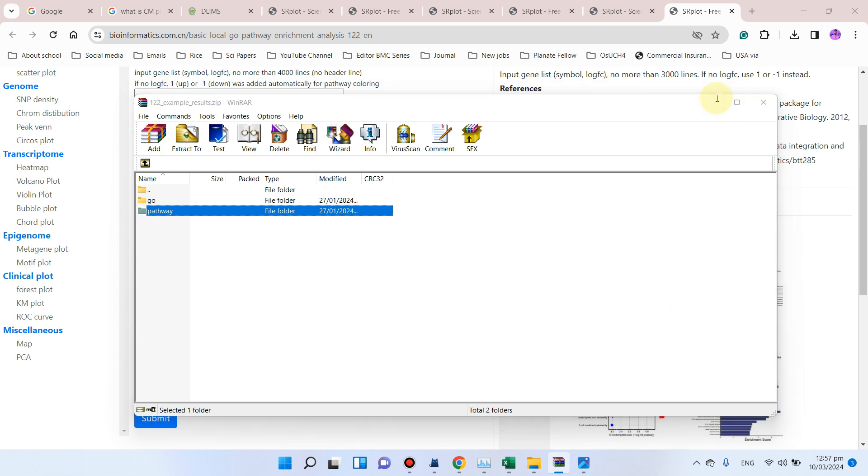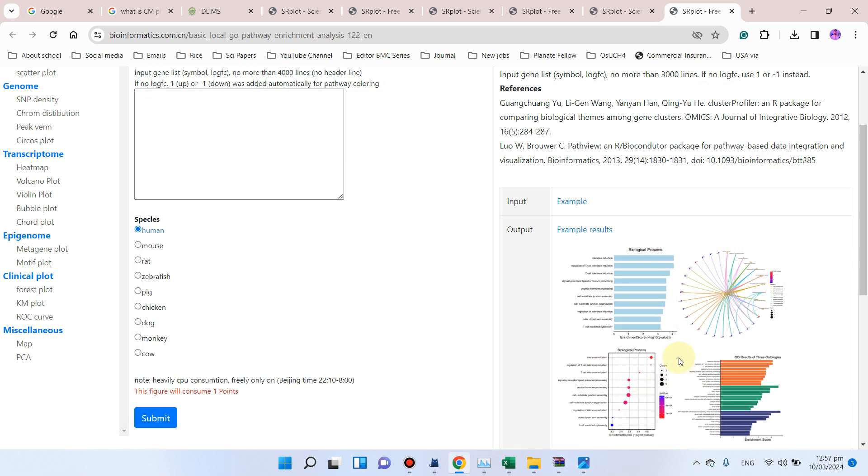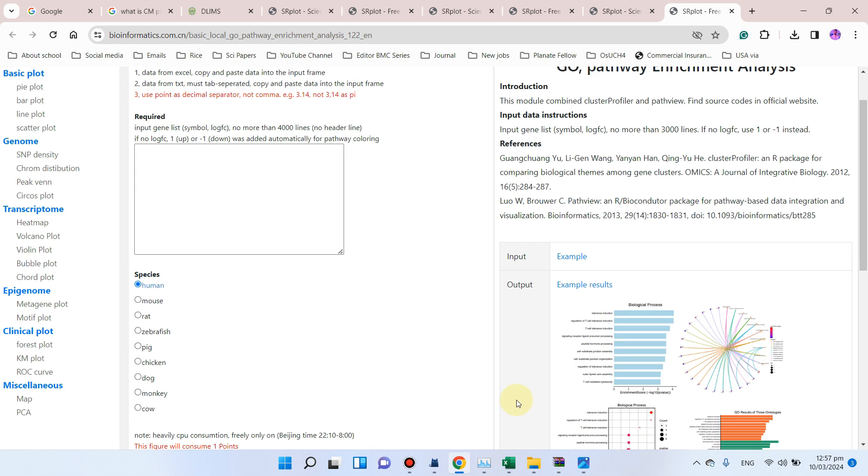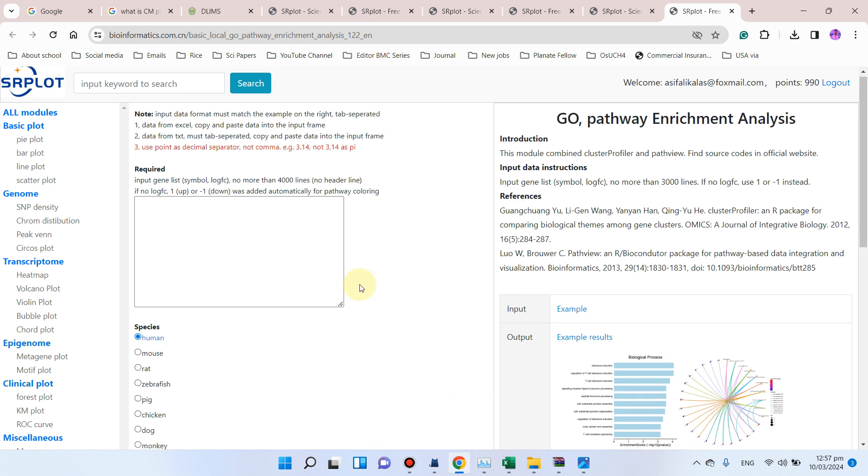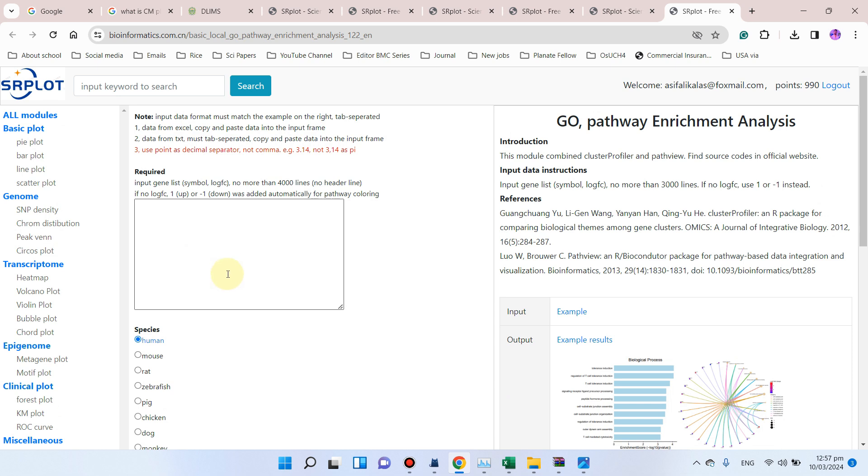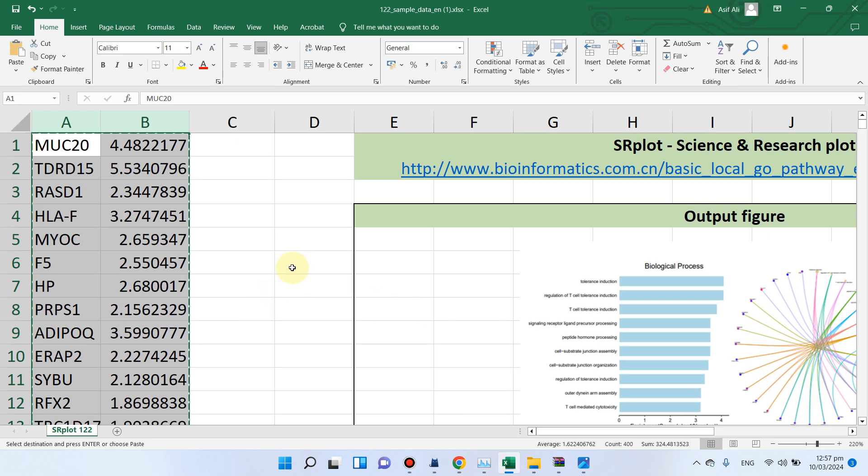For this GO pathway enrichment analysis, you will get your results in the form of these two folders which I have already shown, including all these four figures.